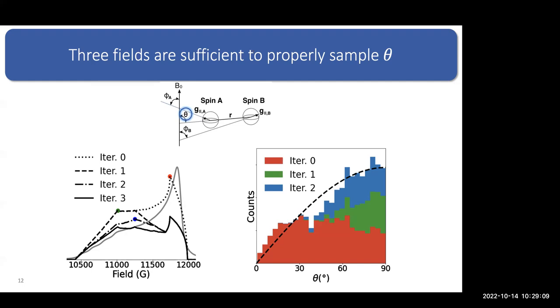Very, very nice talk. I do have a very quick question. I didn't quite understand the setting of this three-field position. What offset were you using between pump and observer pulses, and are you setting this three-field position with the pump fixed? If you can give a little bit of detail about this, that would be great.